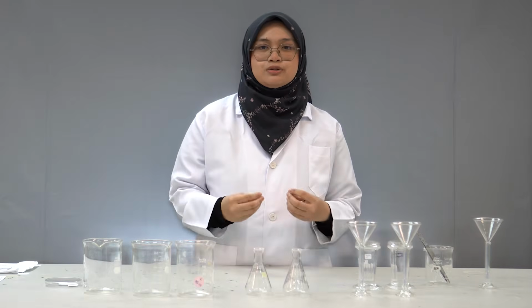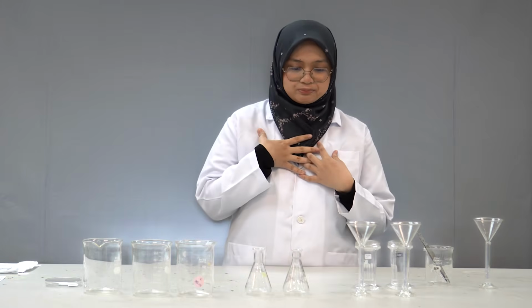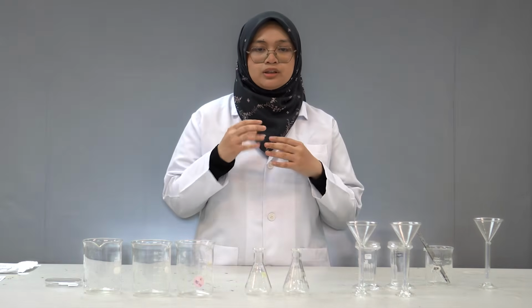In our lab, we do not use UV goggles, but we use a plastic shield that blocks the UV rays from us. This is very important because UV rays are very harmful, so we must make sure ourselves do not contact directly with it.